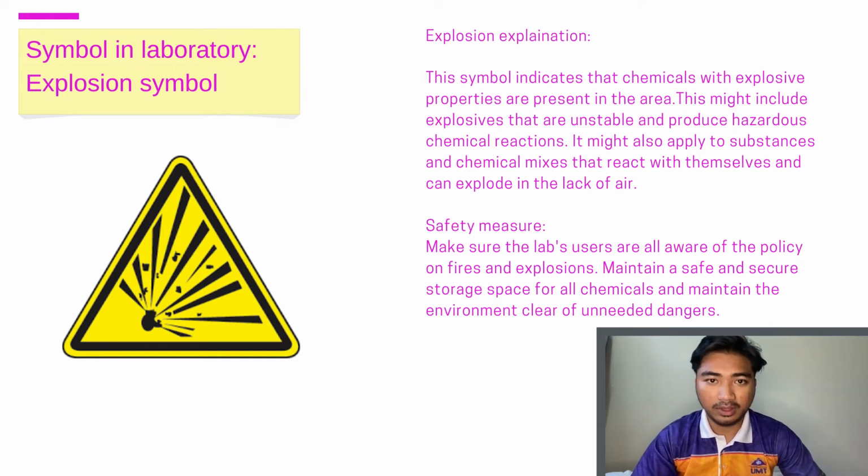air. For the safety measure, make sure the lab's users are all aware of the policy on fires and explosion. Maintain a safe and secure storage space for all chemicals and keep the environment clear of unneeded dangers.